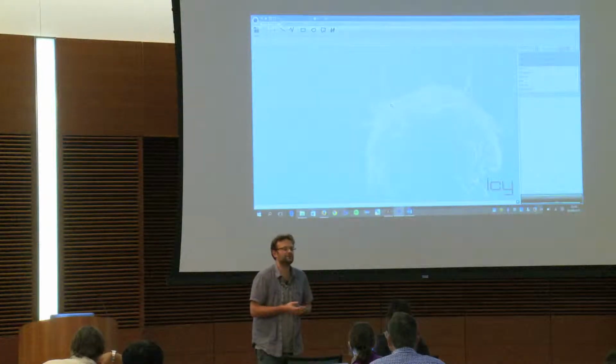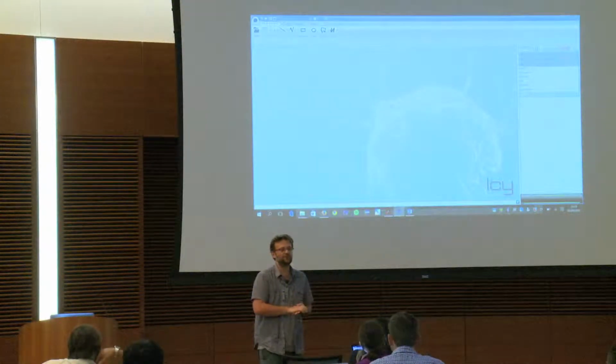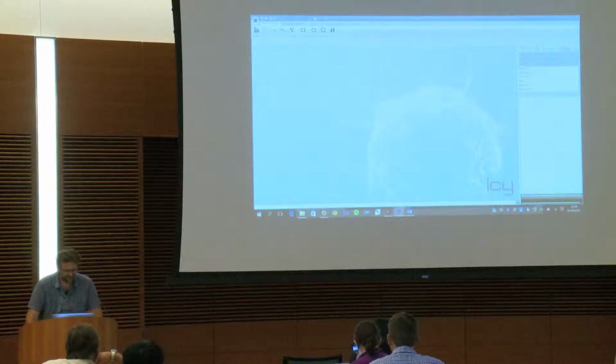And by the way, are you interested in the tracking things or not? Because we have some tracking stuff that is quite okay. So if you want a little demo, during the time you think about something that you want to ask, I will show it to you.